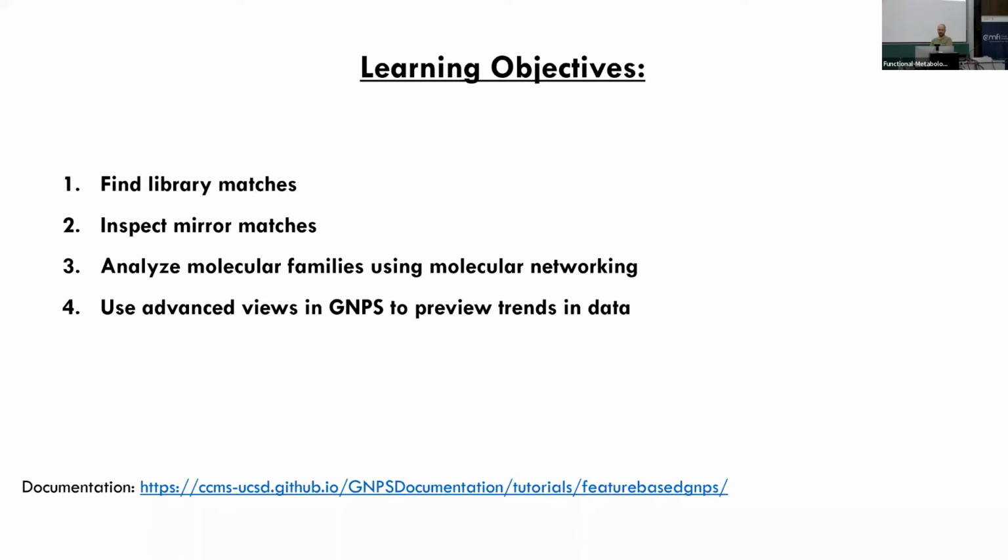One important thing: there's this link down here, which we can also paste in our resources document. There's extensive documentation for GNPS. We put a lot of effort into making a written documentation under this link, and it also includes a lot of videos and recordings of past workshops we did. So there's quite a ton of resources online.